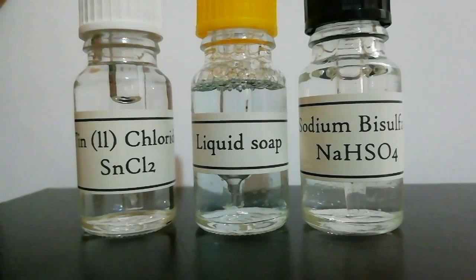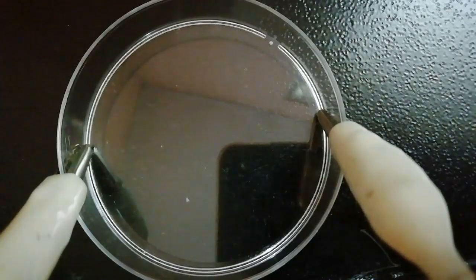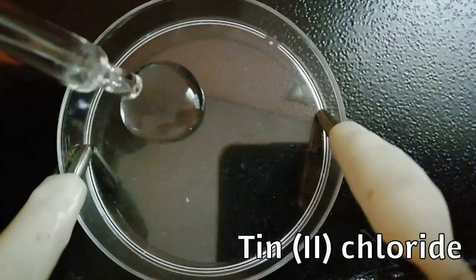You can use 4 AA batteries or a power pack. Tin(II) chloride preparing process is shown in a previous video. First you need a petri dish with 2 crocodile clips attached to the bottom like in here.